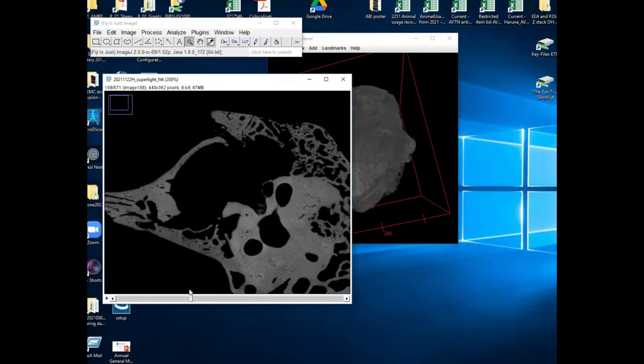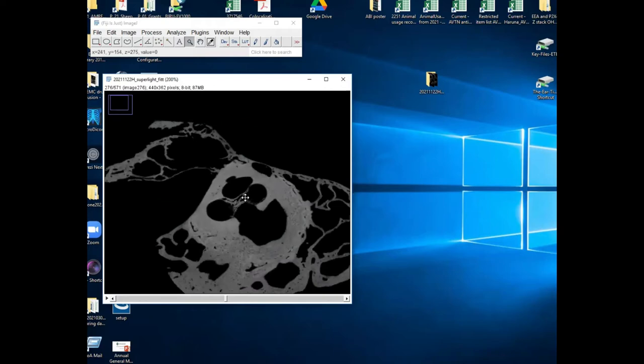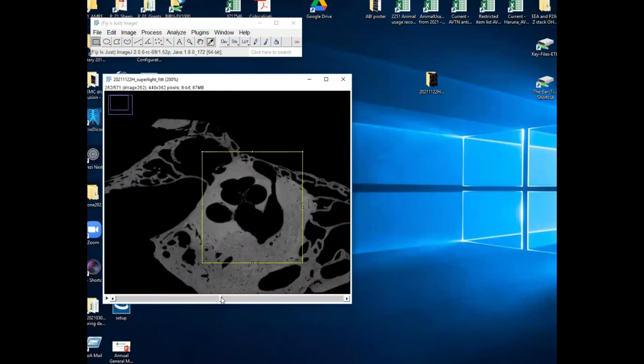So that's what the sample is. And I guess the use of this potential data set for you, Grace, would be looking at the canal and the cochlea. For you, Senorita, this is a human cochlea, and it has an inner ear fluid space and the outer shell. So you won't need this edgy piece, but you might. One is more of a cropped version, so we can crop it. You might not even need the vestibular system.